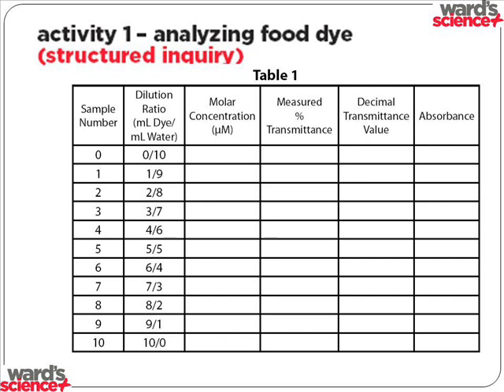Then we go into procedure one, which is the structured inquiry. It says students should obtain 60 milliliters of food dye blue number one, which is 6 micromolar in concentration — which we provide right in the box so you don't have to do any dilutions, saving time, energy, and money. They also need to make sure they have water present, as well as pipettes and a cuvette. One easy way to do the dilutions — we tell them to prepare a serial dilution — is with test tubes. I've labeled 10 test tubes 1 through 10, and did the dilution for each one, the first being 10 milliliters of water and number 10 being 10 milliliters of blue dye number one.